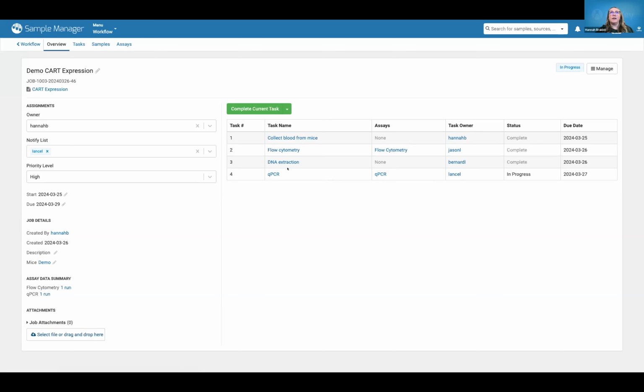And as each of these are getting completed, the team can go and reference the pieces of what they've done within the ELN as well. So it really allows for this structured email notification system to be able to guide and drive some of the work that we're capturing ultimately within that ELN.